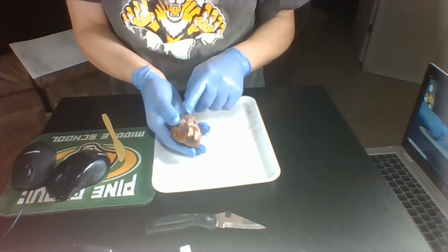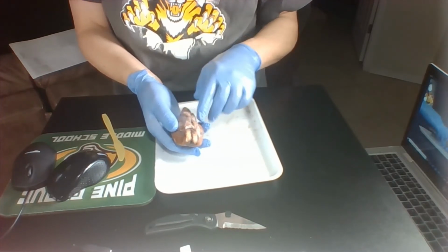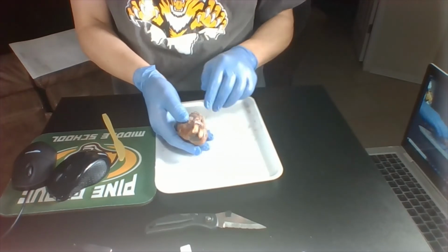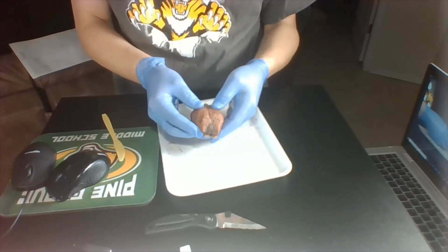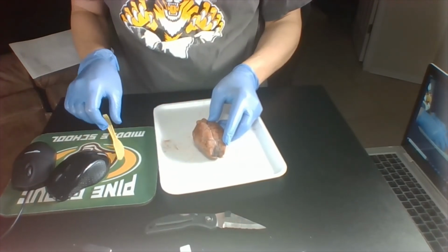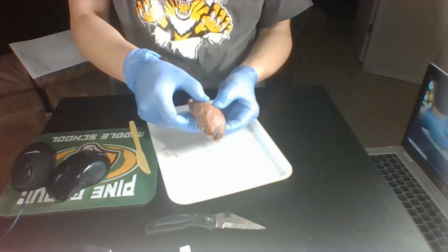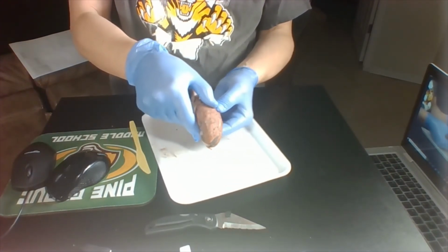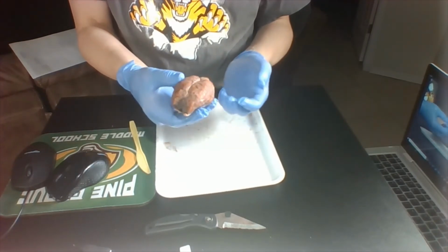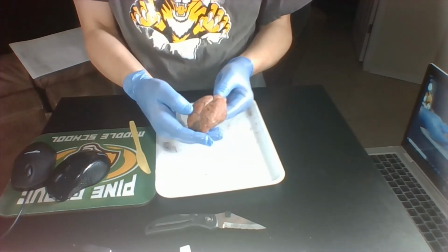And there are some parts that we didn't do on the bottom, like some of the nerves. We're just not going to do that because we're just doing the basics this time. But now we're going to do the internal, so we're going to cut it. And we're going to start with just cutting it right down the middle. You can already see that the two hemispheres have a divide in the middle, just like a human brain. Remember, the sheep brain was chosen because it's very similar to a human brain. It's like a miniature human brain.